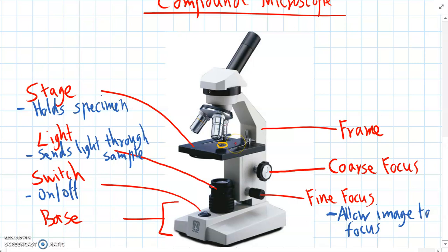And to make sure the specimen doesn't move around there are these metal clips. Two little clips. And we slide the specimen under it. And these are called the stage clips.